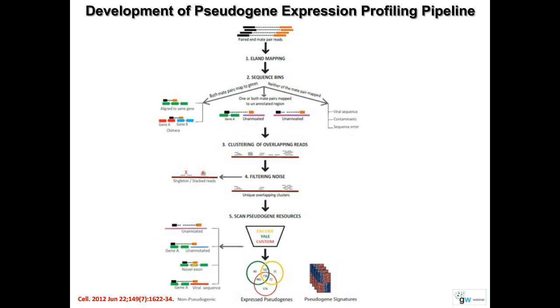There is a database separately available for pseudogenes, and the reads can be mapped against those databases instead of the normal human reference sequence. You will then be able to identify those pseudogenes. In the next slide, I will show an example of how we separated it out.